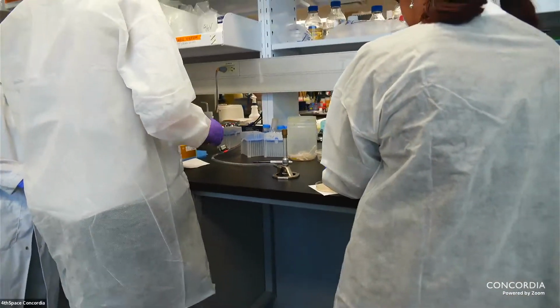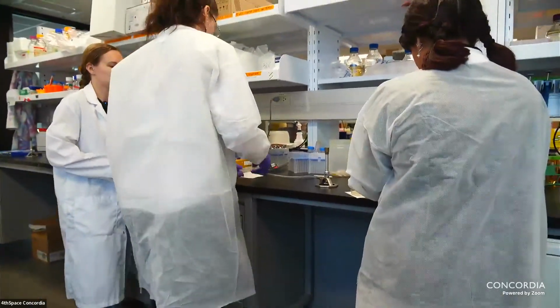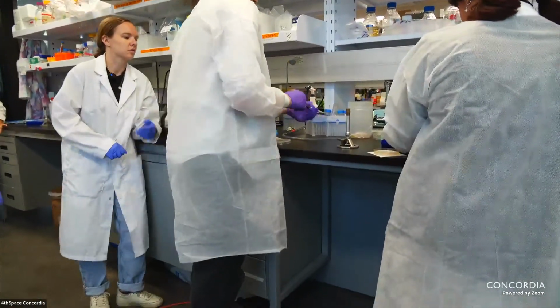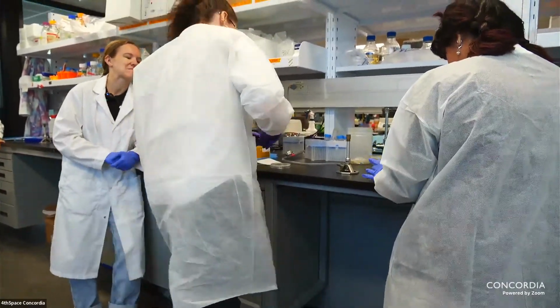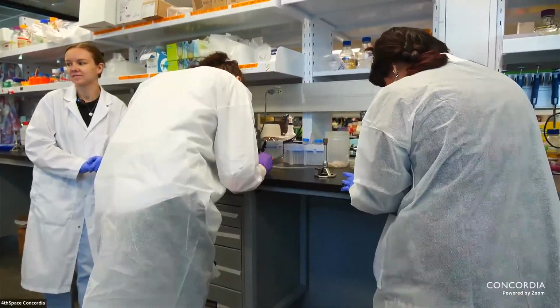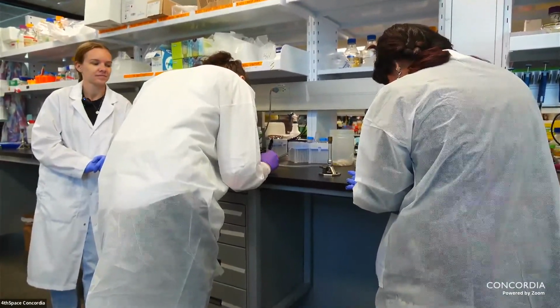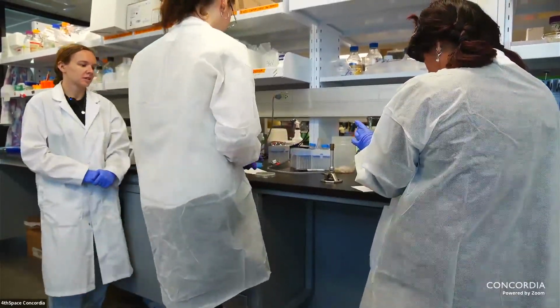Yep, exactly. Yeah. Awesome. And then just write your initials on the top here. Or if you already wrote on the bottom, it's okay. Actually, maybe just do it again.